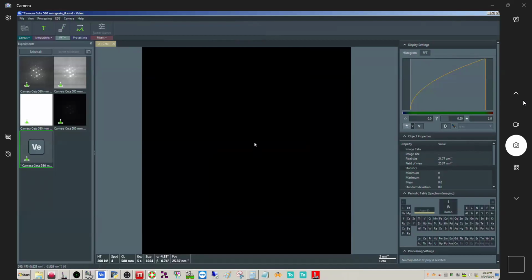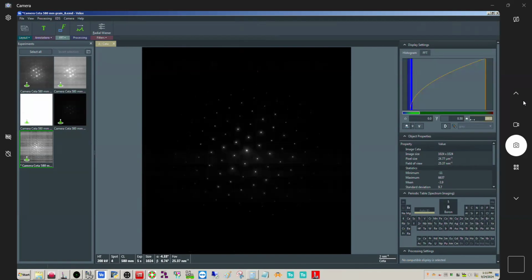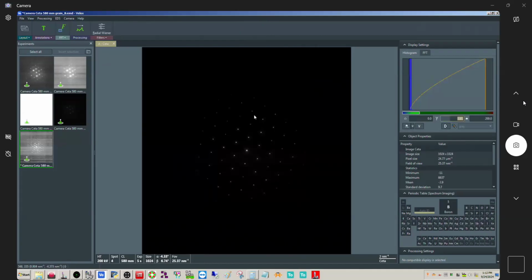And now if this doesn't look good, what we can do here over a reasonable time is also do a series acquisition. Okay, so you can see, let me increase this. Okay, so that's not too bad. Still pretty good here. And if we increase the gamma, then we can again increase this more to maybe 200. Yeah, so that looks good.